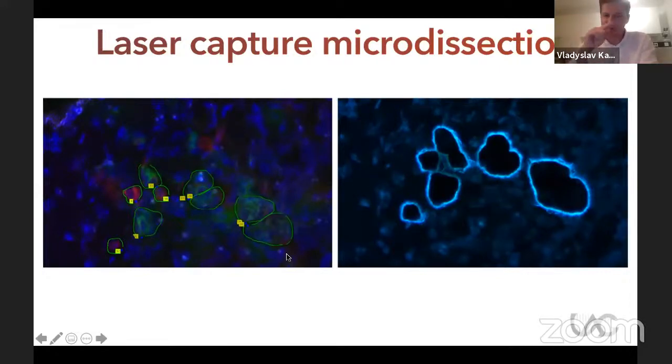Yeah, that you need to target only one single cell that is going through the endothelium. So that means in that case, you need something that has a very high resolution, and the laser capture microdissection would be something that can be offered in that case.